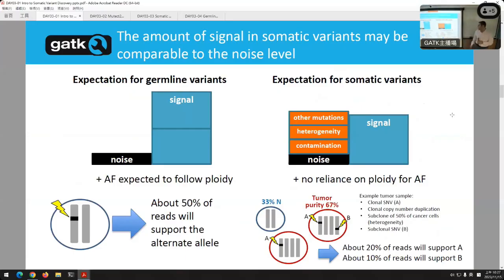Okay, so if you sequence these 3 cells, you PCR them and sequence them, about 20% of the reads will show the A allele, right? Because there's 2 copies of the A in the 10 different chromosomes. And 1 copy will show the B, about 10%. And so that's your allelic fraction. So the A should show up at a 20% fraction and B at 10%. And that's expected. That's normal, not 50-50 anymore. Does that make sense? This is why we don't see a 50-50 ratio in cancer. That's important to understand. Everyone understand that? So when we talk about allelic fraction, that's what that is.